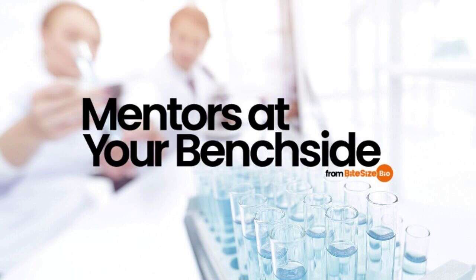But this does not normally happen as long as you do not let the sample sit for long after the centrifuge stops. Once it is done, be right there to decant the sample. The only times I have seen a pellet come loose from the wall is when I was late getting to the centrifuge, and it sat still for a few minutes. Whether you use Oak Ridge tubes or glass, just note where that pellet should be.